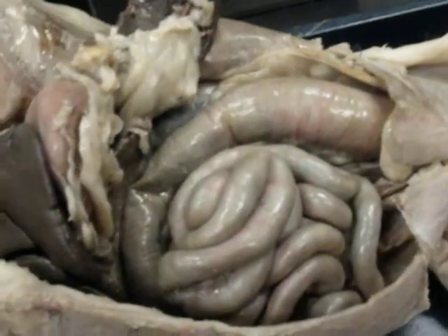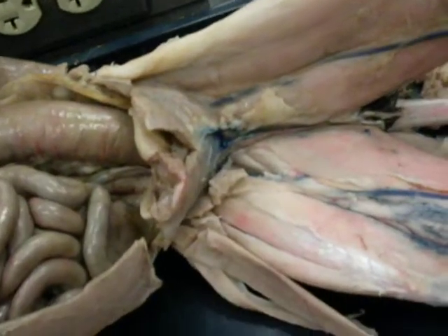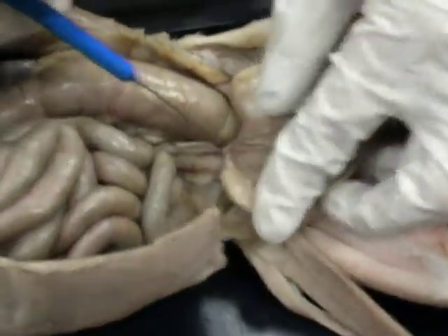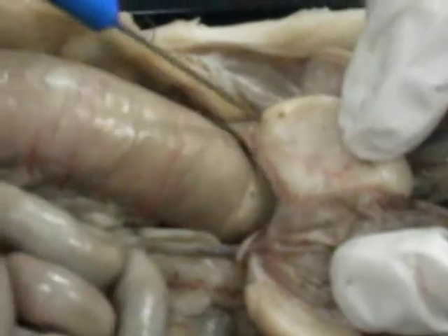Okay, for next time, you can cut away your fat here, but don't cut this off because this is your urinary bladder. And also, don't cut these loopy things off right here and here, because that's your vas deferens for the male. You can cut the fat up to the loopy thing, but don't cut the loopy things off. And don't cut, see if I pull this, see how that moves? Don't cut that off either. The ureters? Yes. Excellent.